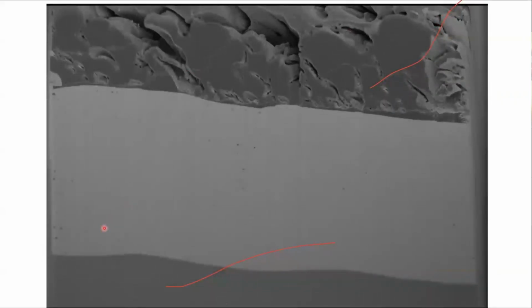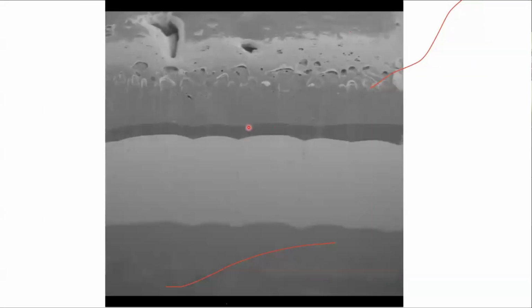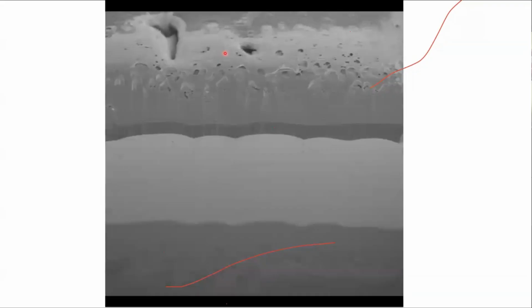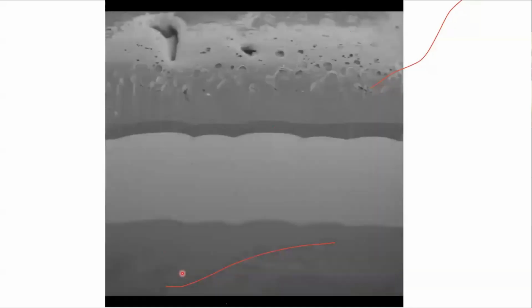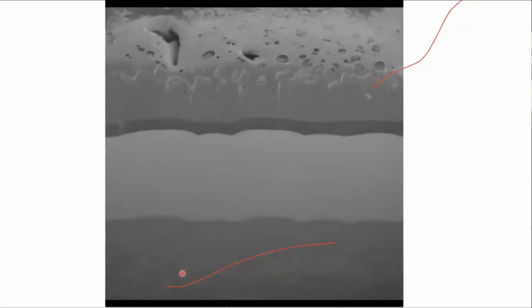Afterward, we standardized the conditions, and now you can see that the complete layer of GIS is visible, and this outer, upper layer is finally the sputtering layer, and you can see some information. Still, we are standardizing this technique: after high pressure freezing of a tissue, can we do slice and view as well as prepare the lamella for cryo lift out.